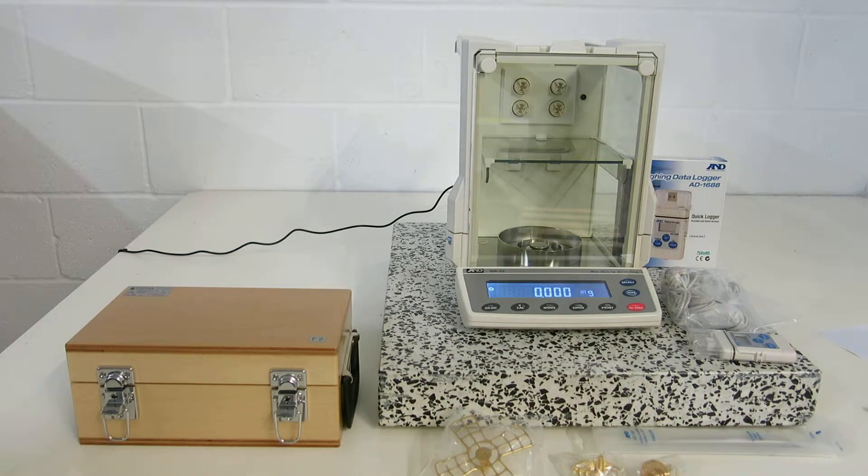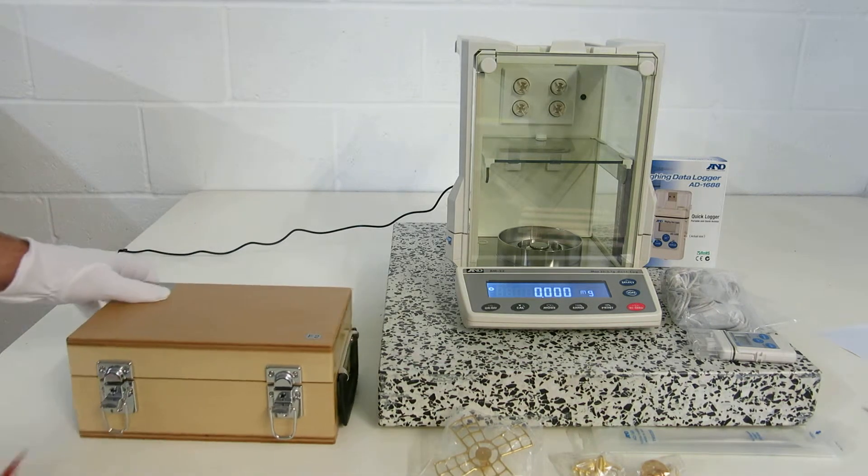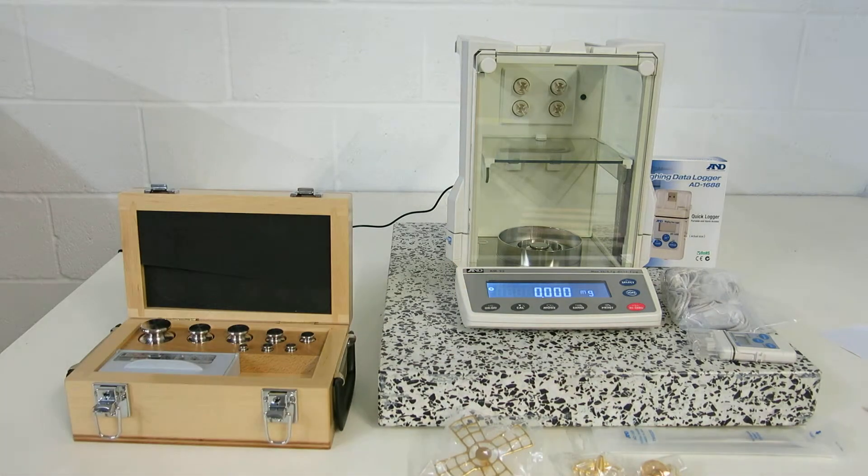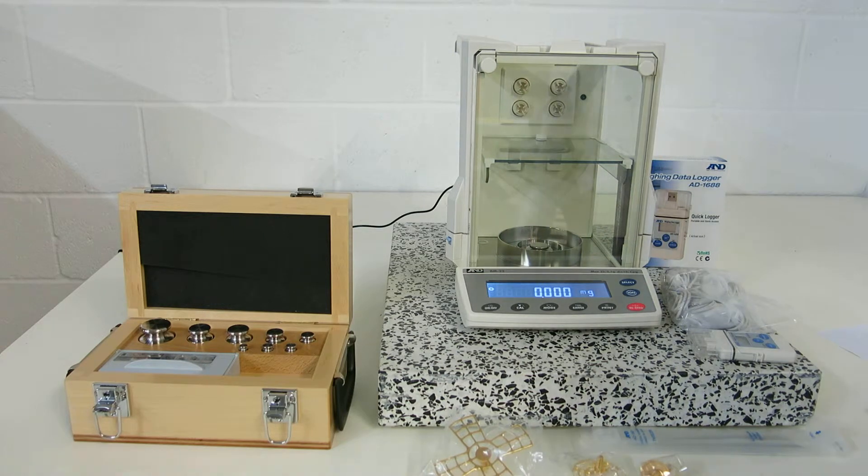It's a dual range, 5 and 6 decimal place instrument. What we're going to do is just quickly take you through some of the features with this particular balance. This is a pretty new product, it's only been out 3 or 4 months now, and it's enjoyed a lot of success both here in the UK and overseas. So let me run through without further ado.